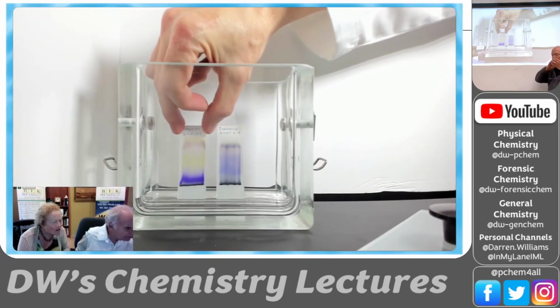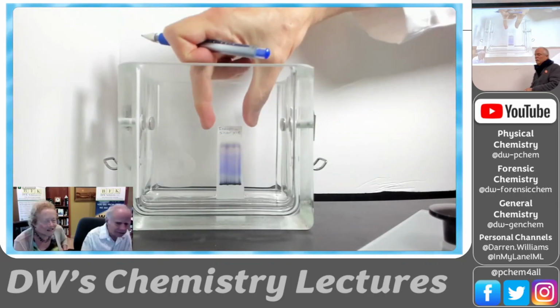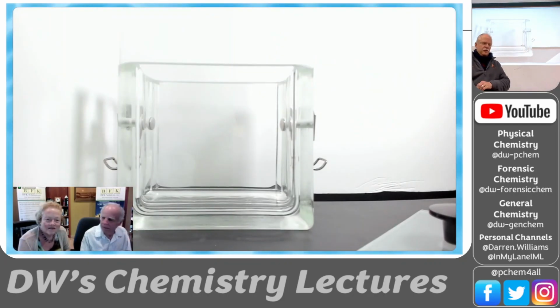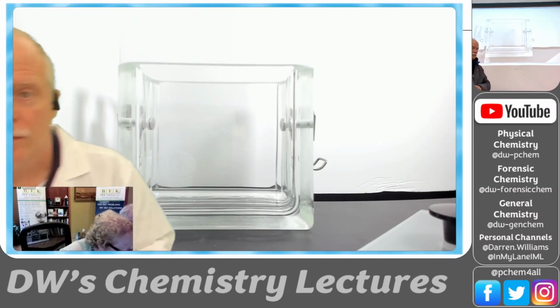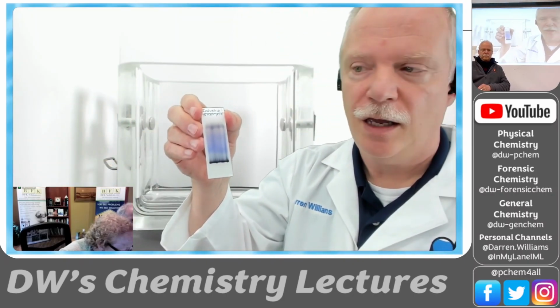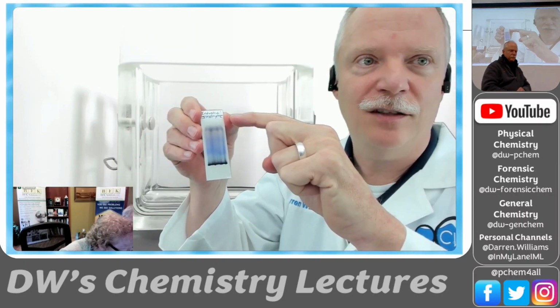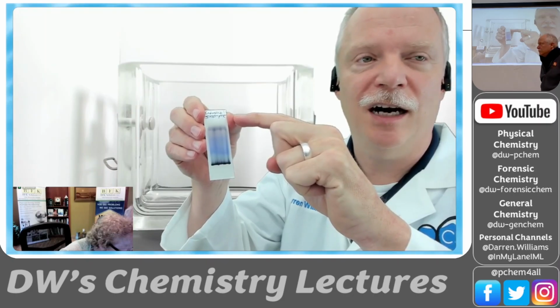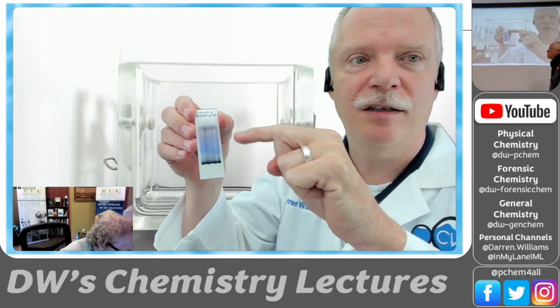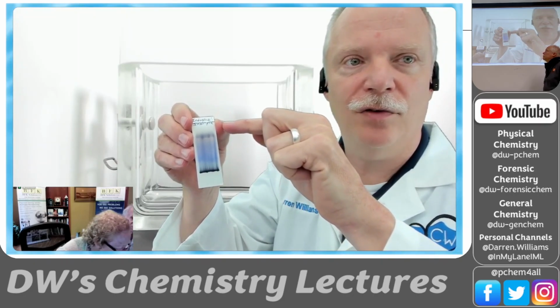So immediately I pull it off and make a mark. The thing that you need to do when you pull these out is immediately mark the solvent front. So this is the industrial Sharpie, and notice I've marked the solvent front. In chromatography, that's very similar to the retention time, is the ratio in centimeters or millimeters from this point to the solvent front.